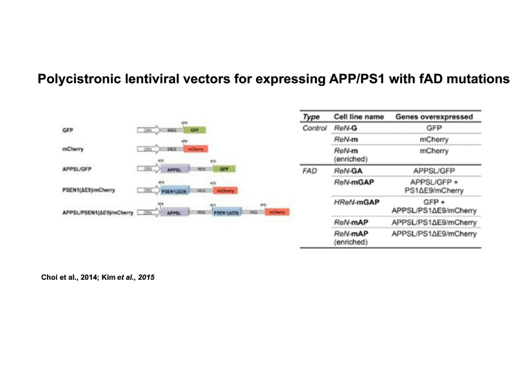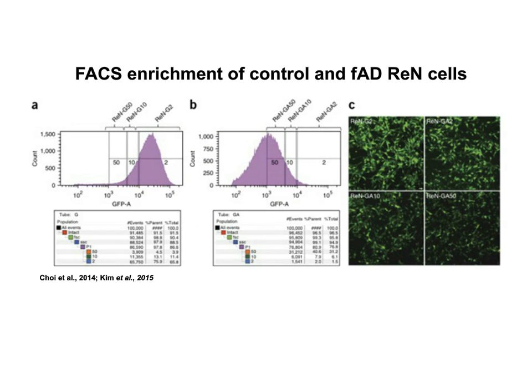This is one of the examples of how we did the FACS sorting. Basically it's simple. We transfect with the lentiviral vector, and as I just briefly mentioned, APP is linked to the GFP levels here. You can see we selected the top 2%, top 10%, and top 50%. That means we have 3 different lines with different expression levels of A-beta. And as a control, we sorted the same signals with GFP alone. That is actually a good control for our studies.